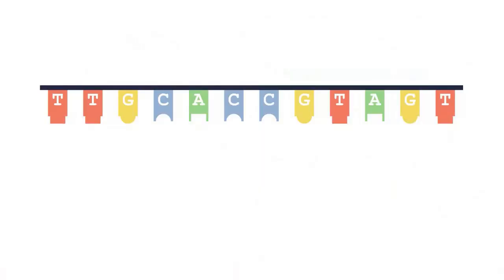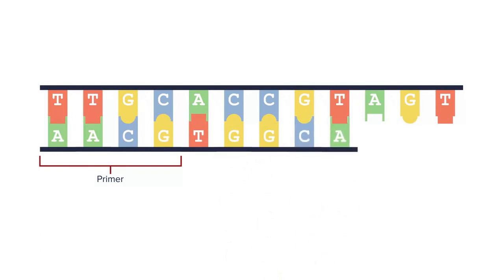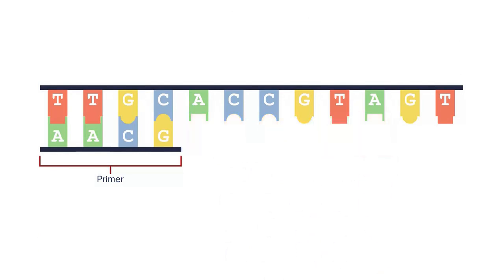As the PCR reaction runs, the creation of each DNA fragment starts, as usual, with the primer. After the primer attaches to the template strand, the DNA polymerase goes to work and begins to add the complementary nucleotides, creating the new DNA. As you know, whenever there's an A in the template strand, DNA polymerase attaches a T to the new strand. Whenever there's a C, a G is added, and so on.